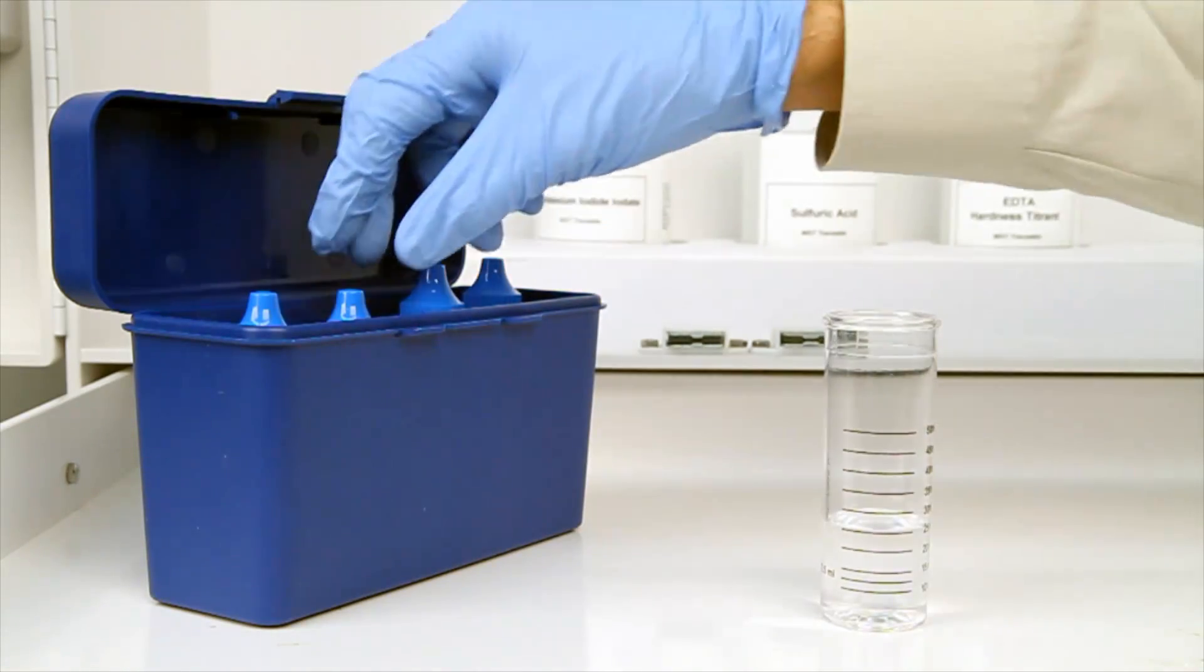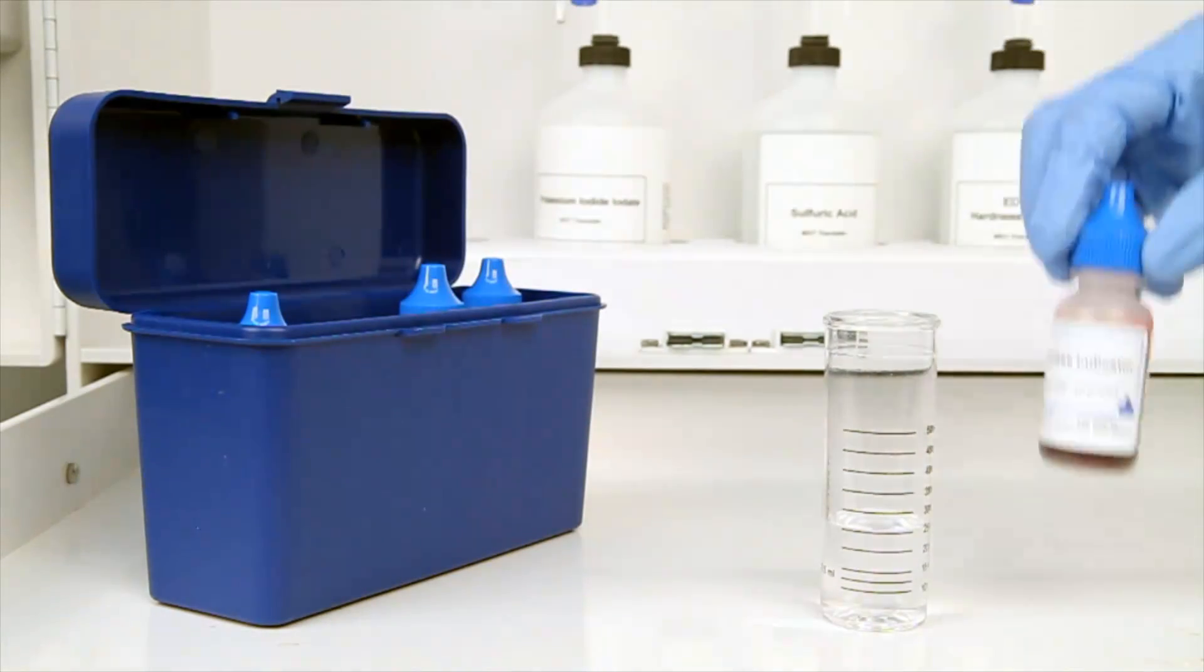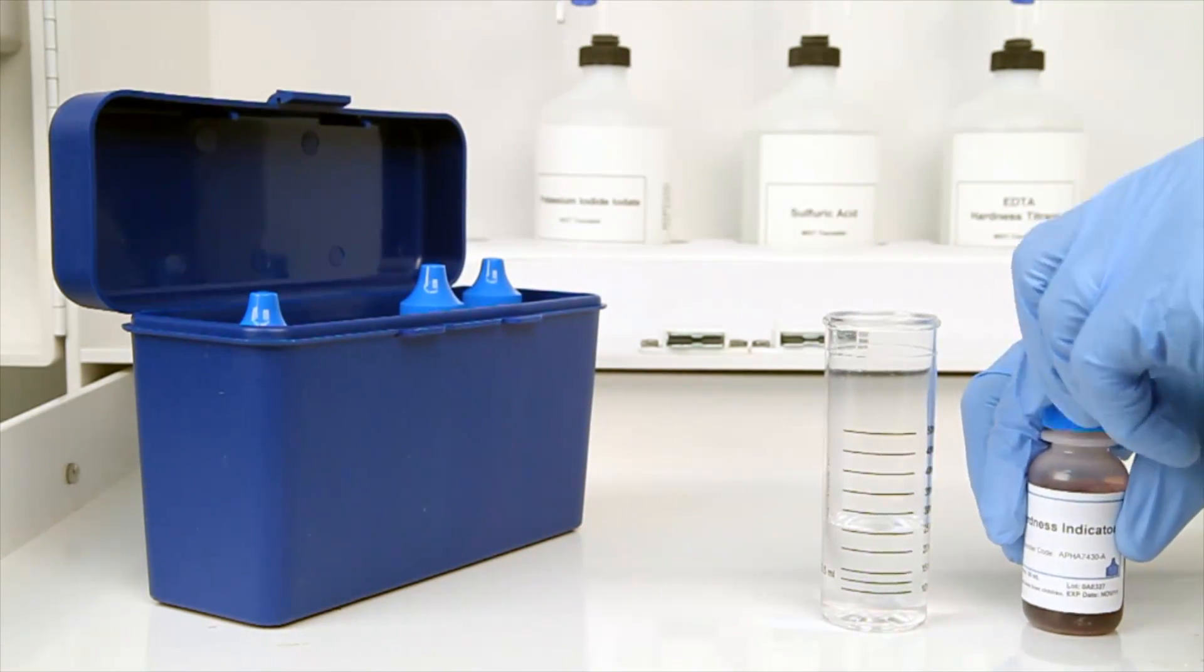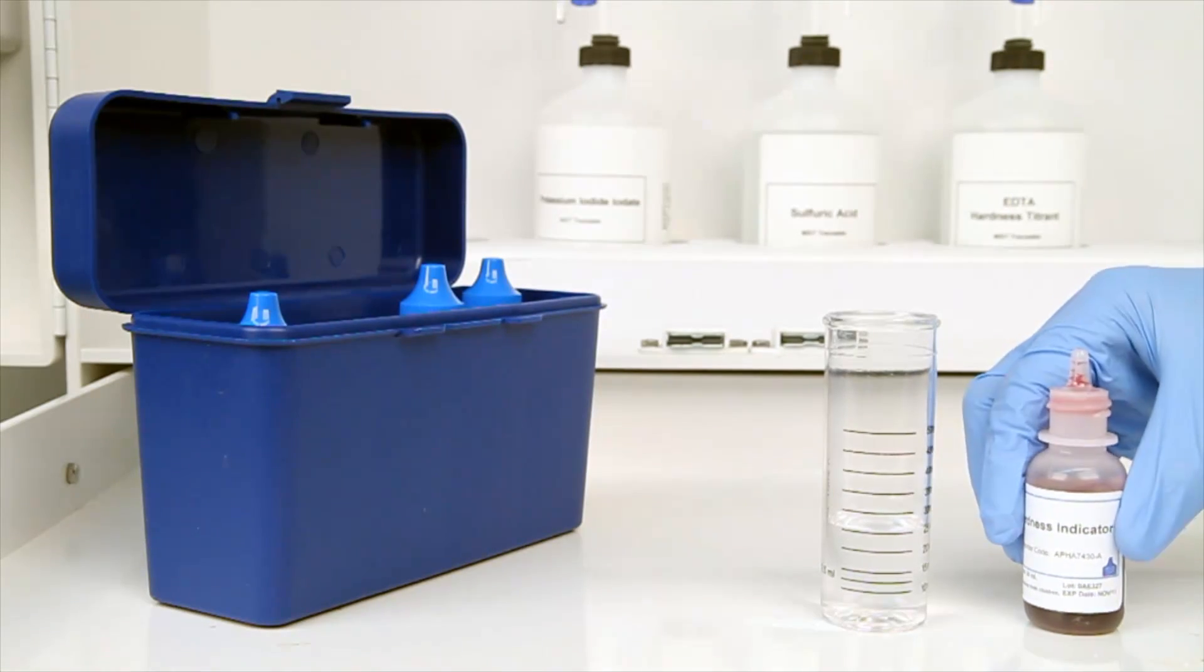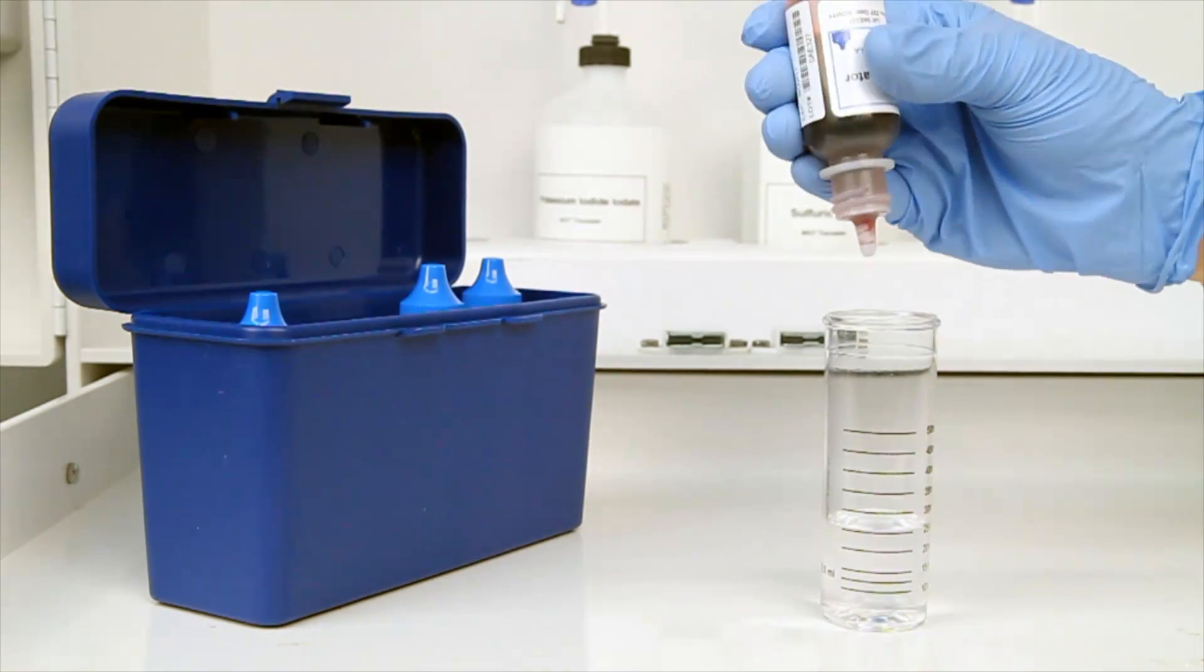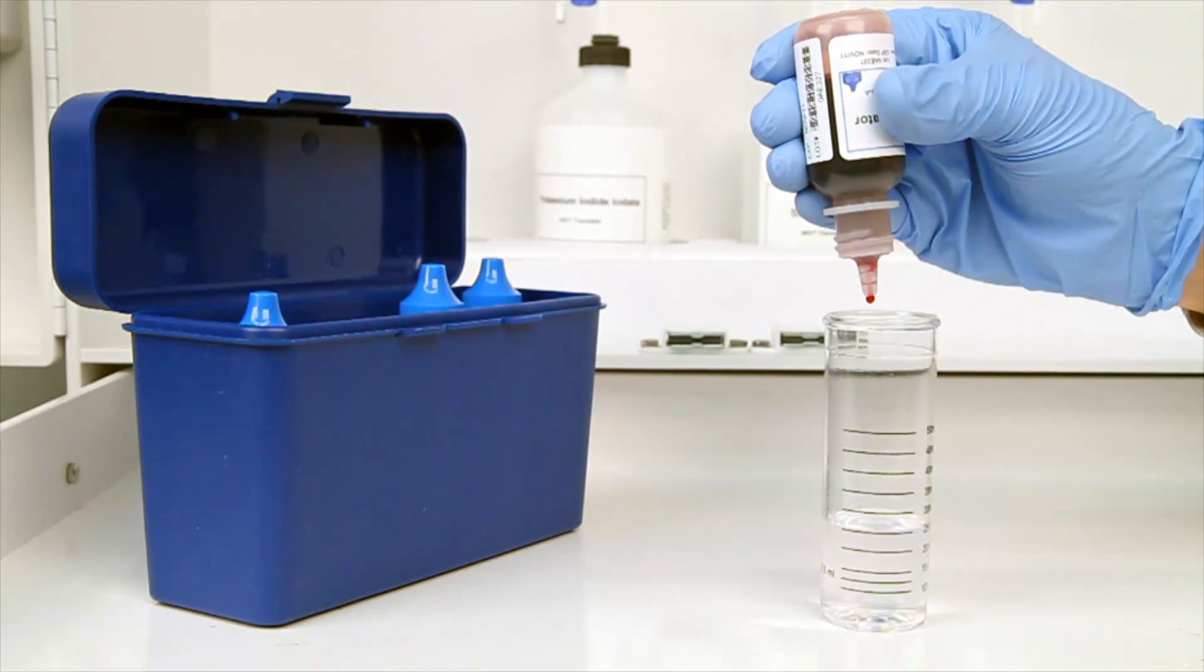The next step according to the Endpoint ID procedure is to add five drops of hardness indicator. Be sure to hold the bottle vertically to get a consistent drop size and remember to swirl the vial after the addition of each reagent.